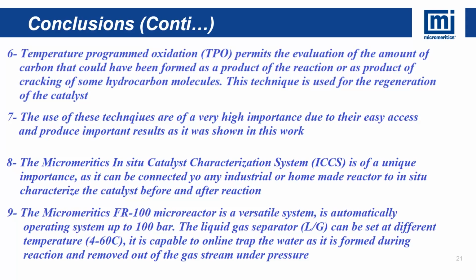While these techniques, temperature program reduction and oxidation, are very simple techniques that can be very easily accessed by any researcher, any research center, or any university, because their prices are much less than any sophisticated technique for characterization. The in situ catalyst characterization, I insist on this, is a very small technique.